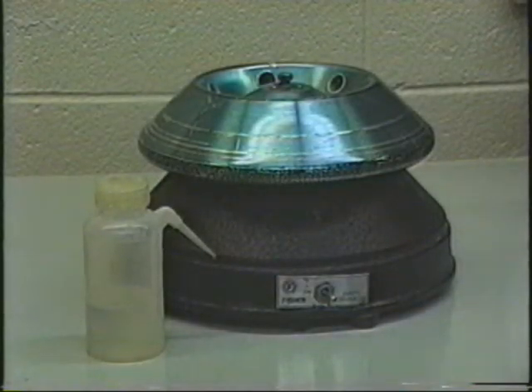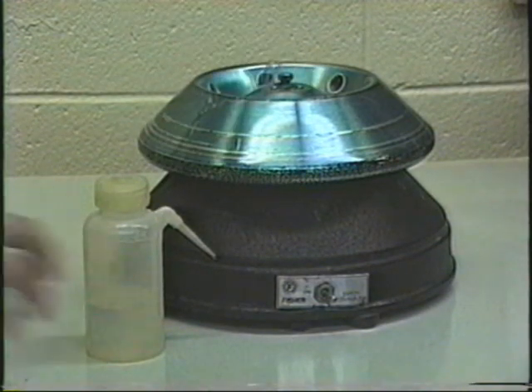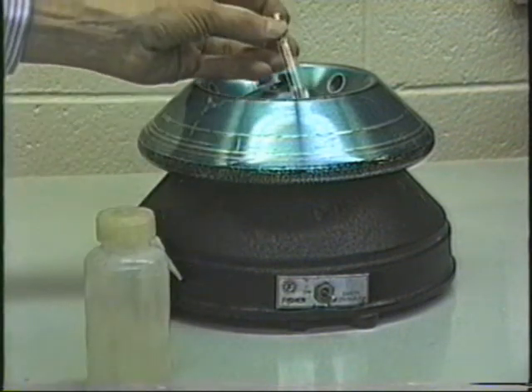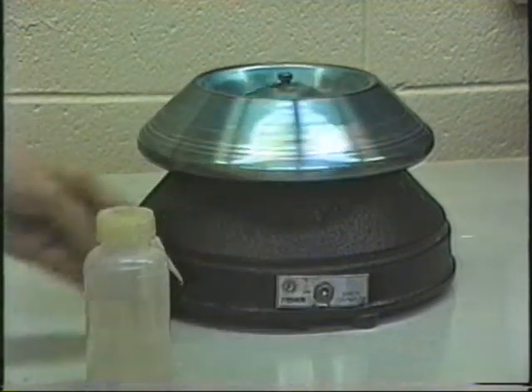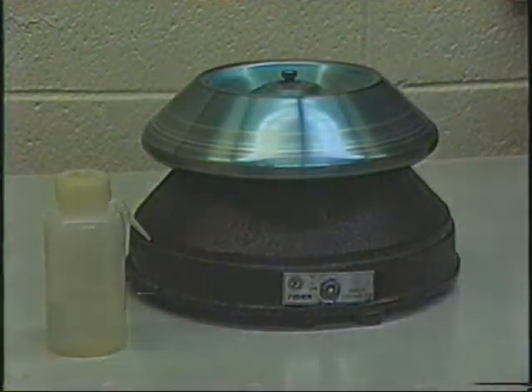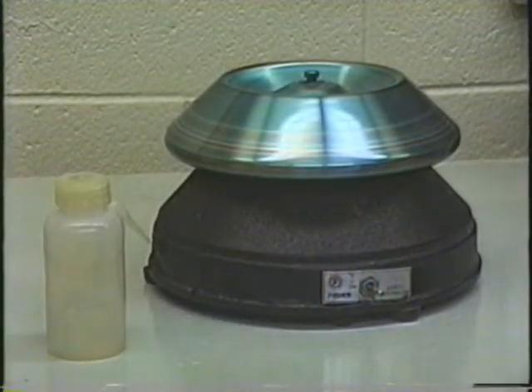To use a centrifuge, put your tube with the sample in one of the holes of the centrifuge, and then you'll put in a counterbalancing tube opposite it. Fill it approximately the same amount and put it so that it is opposite. Then turn on the centrifuge. In about 30 seconds, you can turn off the centrifuge.